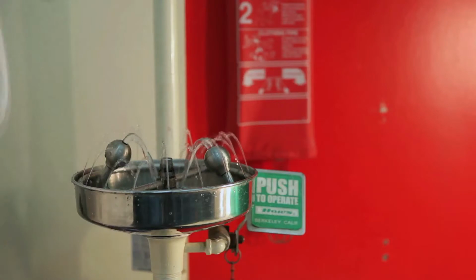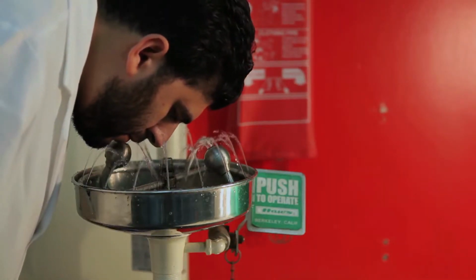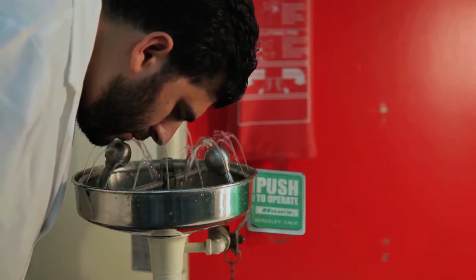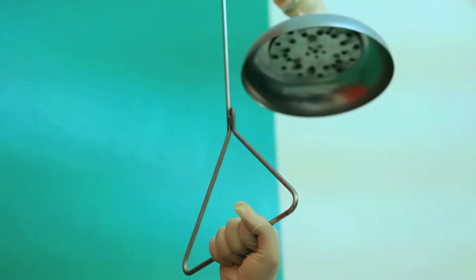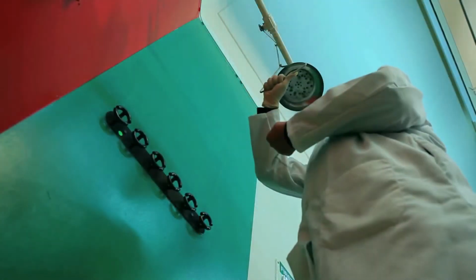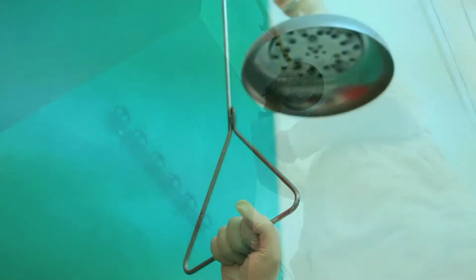Familiarity with laboratory emergency equipment is essential. In areas where chemicals are stored, used or handled, an emergency shower and an eye wash station must be accessible within 10 seconds. If your lab coat catches fire, use the emergency shower to douse the flames. Use the shower long enough to remove any contaminating material and cool the skin and body. This minimizes damages caused by burns.